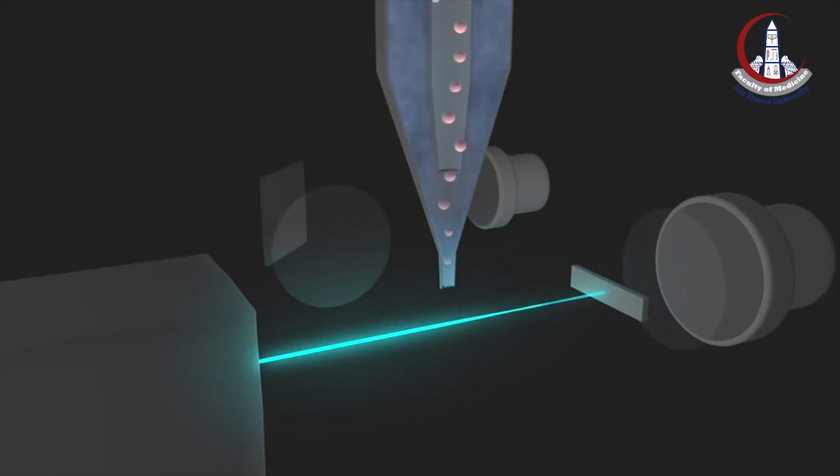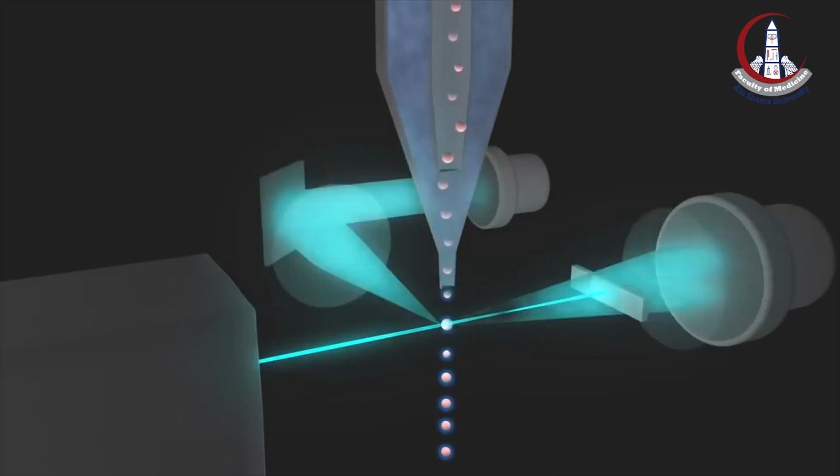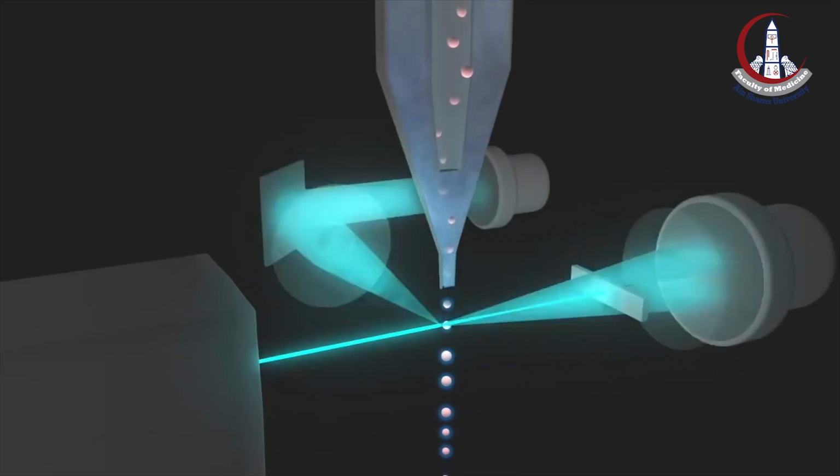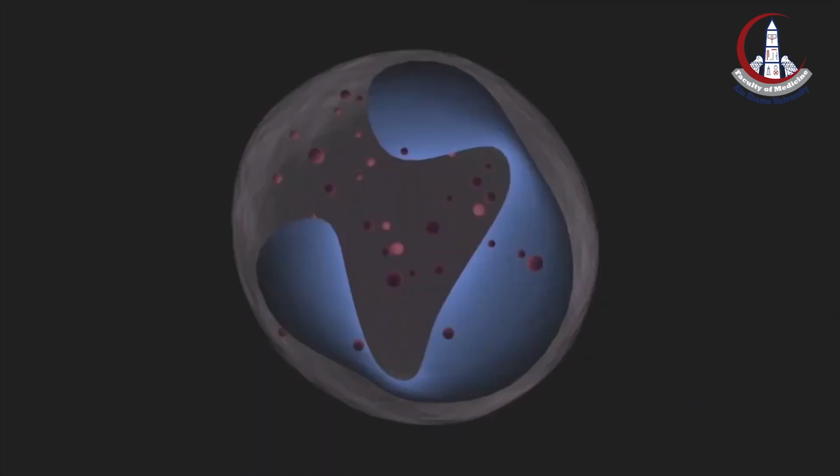Once the sample is placed on the machine, it will be sucked up, it will be mixed into a stream of saline solution into the cytometer, and the cells pass through the chamber in a single line before they pass through the laser. Each cell within the sample then moves across the laser beam, allowing each cell within the sample to be individually analyzed.